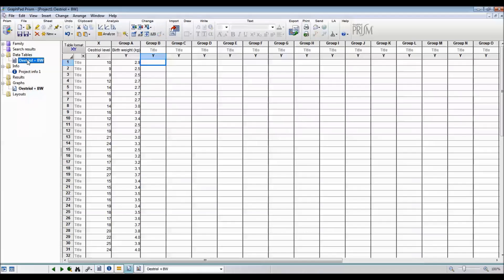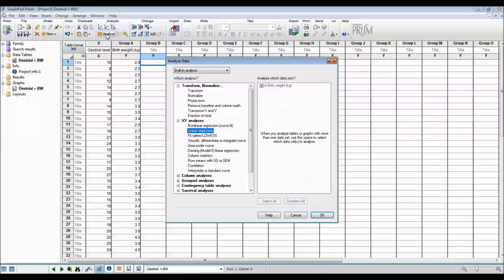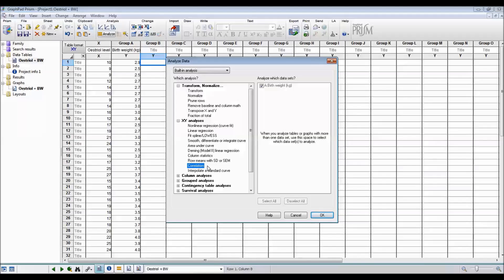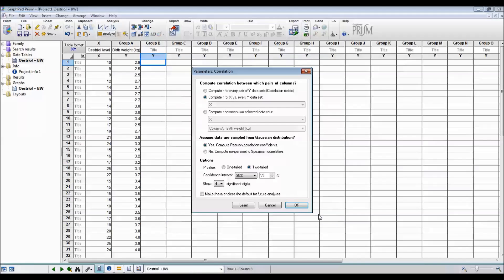The second thing that we're going to do is to look at correlation. So I go back to the data table. I hit Analyze. And I select correlation from underneath the XY analyses. And then I say OK. There aren't many options to choose from. And we only have one X and one Y variable. So computing R for X versus every Y data set is a reasonable thing to select.